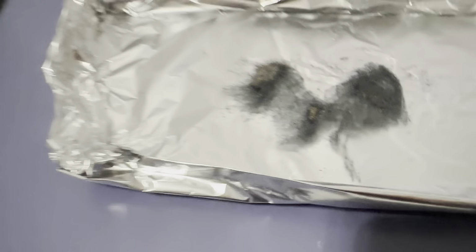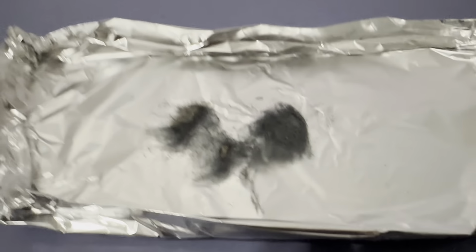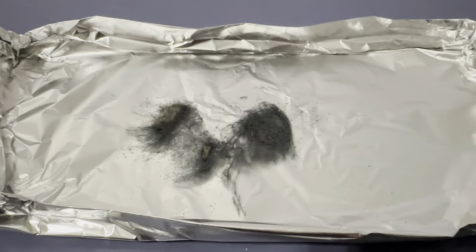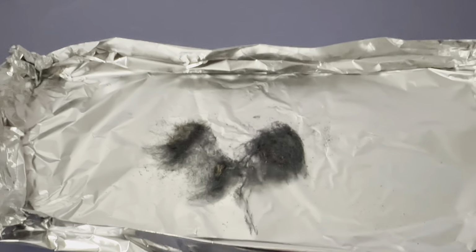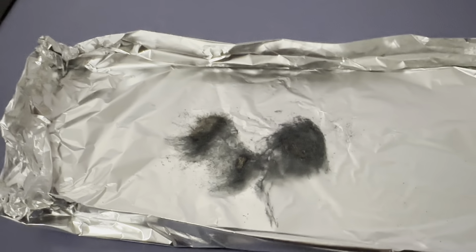Right, anyway. So, looking at our reaction here, what do we think will happen to the mass of our steel wool once we burn it? I want you to think about that, and then I want you to finish this reaction, and then weigh your product, and see if the results might surprise you.